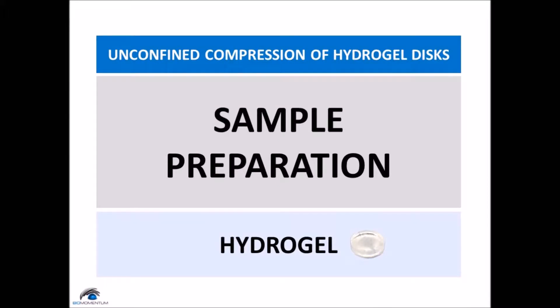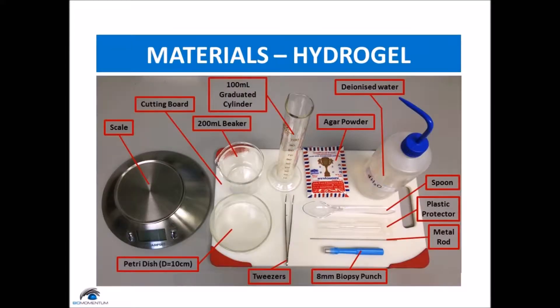For the hydrogel sample preparation, we will be using a scale, a cutting board, a petri dish, a 100 milliliter graduated cylinder, a 200 milliliter beaker, tweezers, agar powder, deionized water, spoon, a plastic protector, a metal rod, and an 8 millimeter biopsy punch.